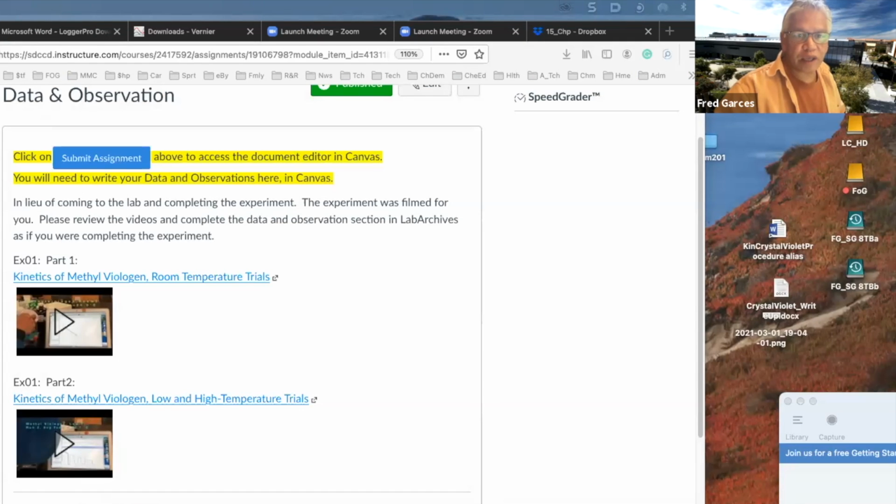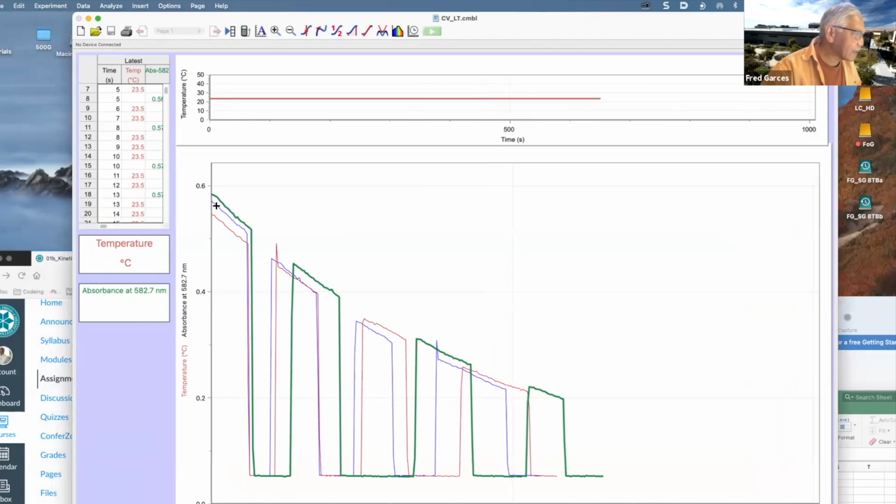Let me show you that real quick. You just want to select like 1, 2, 3, 4, 5. Don't take anything here. 6, 7, 8, 9, 10, 11, 12, 13. Somewhere where they overlap, and that's good. And find 20 good data sets, because there are a lot of data sets here. If you can find that and then you can plot it, it'll make life easier. Okay, so find one in which all three intersect each other.